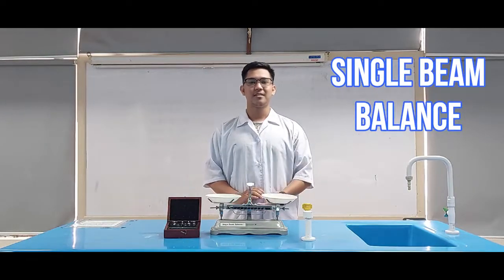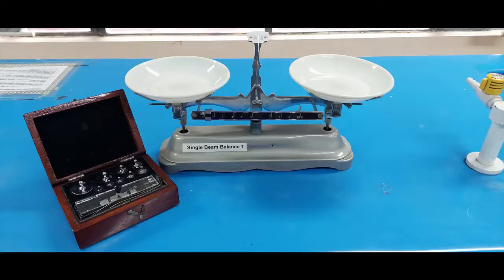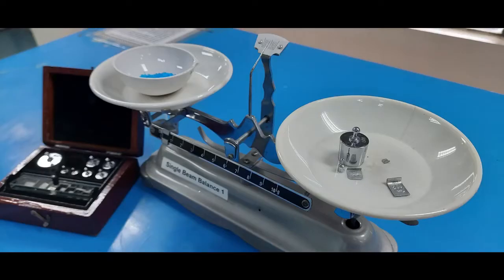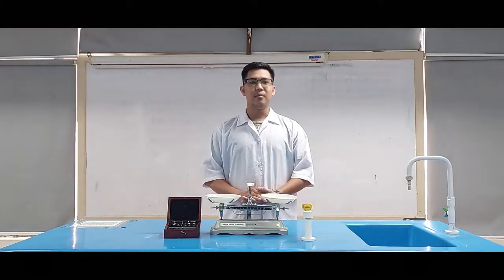Single Bin Balance. This is the modern version of the ancient Egyptian scales. This type of laboratory scale incorporates two pans on opposite sides of a lever. It can be used in two different ways. The object to be weighed can be placed on one side and standard weights are added to the other pan until the pans are balanced. The sum of the standard weights equals the mass of the object.